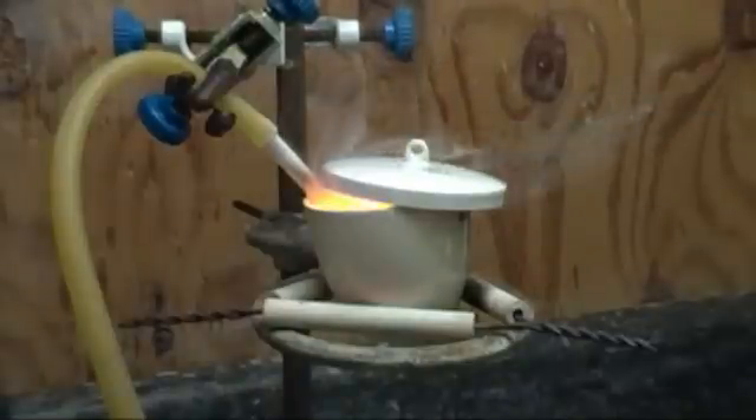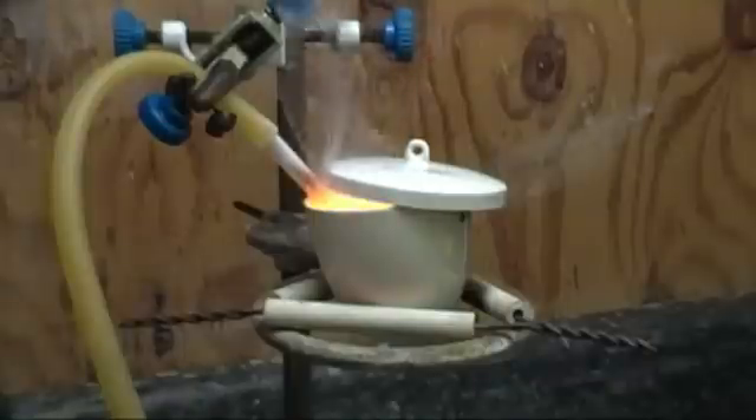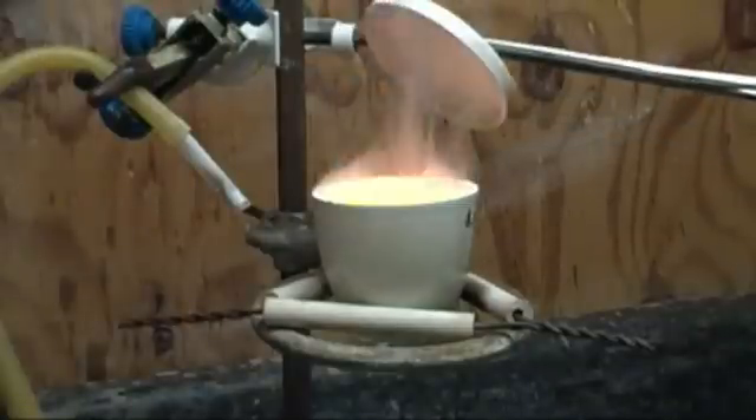If the reaction looks as if it's getting out of hand or too hot, I place a lid over the vessel and turn off the O2. It's very important to regulate the heat, as sodium peroxide decomposes at 675 degrees C. In some cases, I left the lid on for several minutes to allow the vessel to cool down. Upon removing the lid, the reaction started right back up.